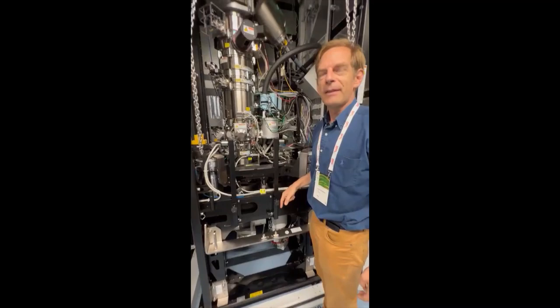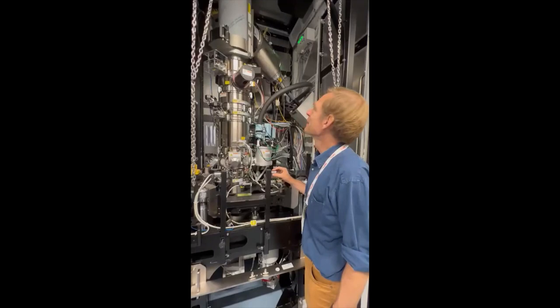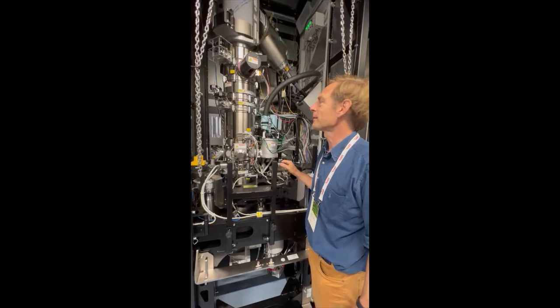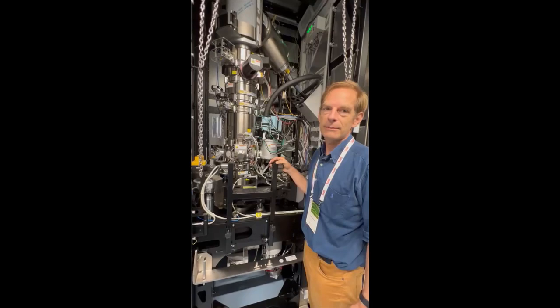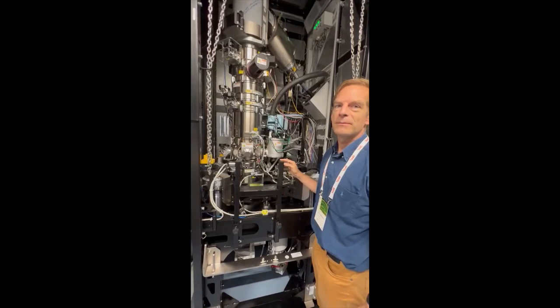This camera is a high-speed camera. The camera alone is more expensive than a house. The whole microscope is millions. We got a special deal. How many of these are there in the world of this type? Maybe 300. 200 to 300.